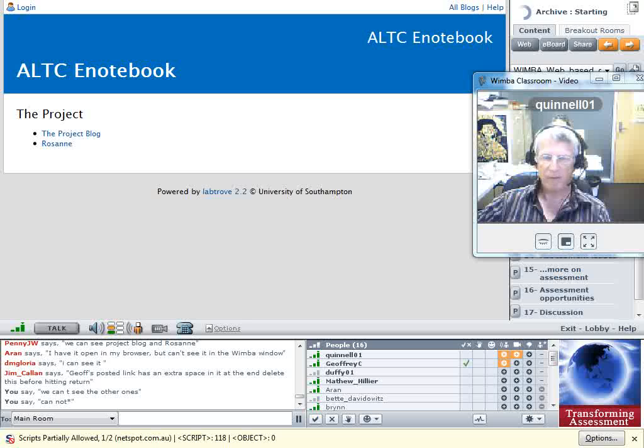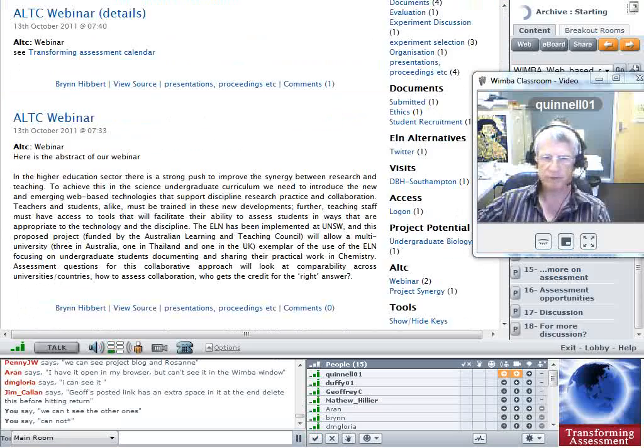Okay. Student Central, general information, essentially that's access to the introduction, course manual, and so on. It also houses templates for MSDSs, etc., and risk assessments, and then each experiment has its own little home, and in there, templates for experiments, the actual experiment itself, and students can upload their reports, and so on.